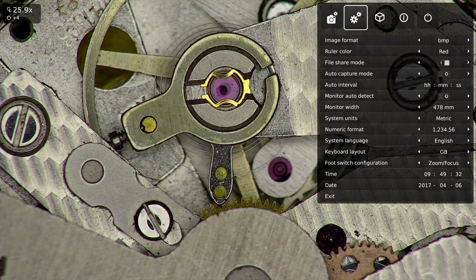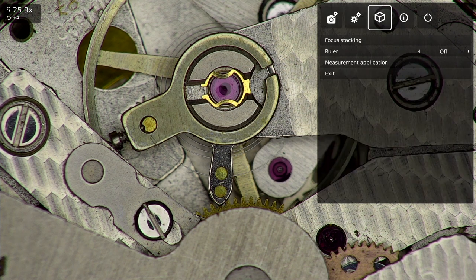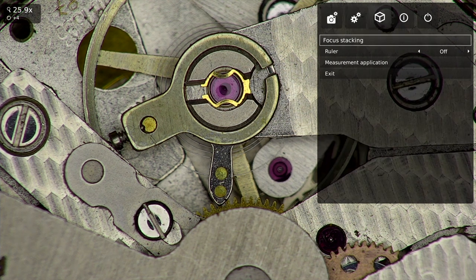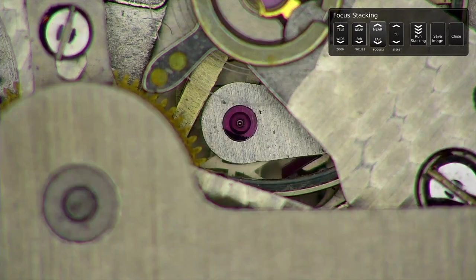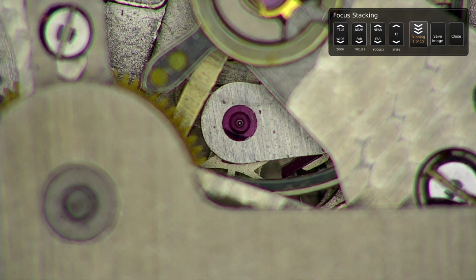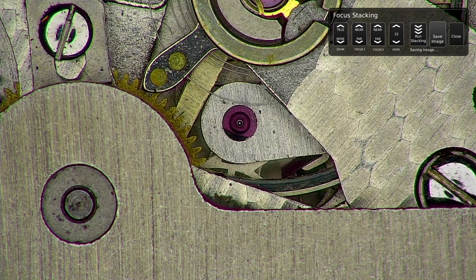By stacking images with different focuses on top of each other, I am able to capture one image which is sharp all the way through, with no blurred and out-of-focus areas.